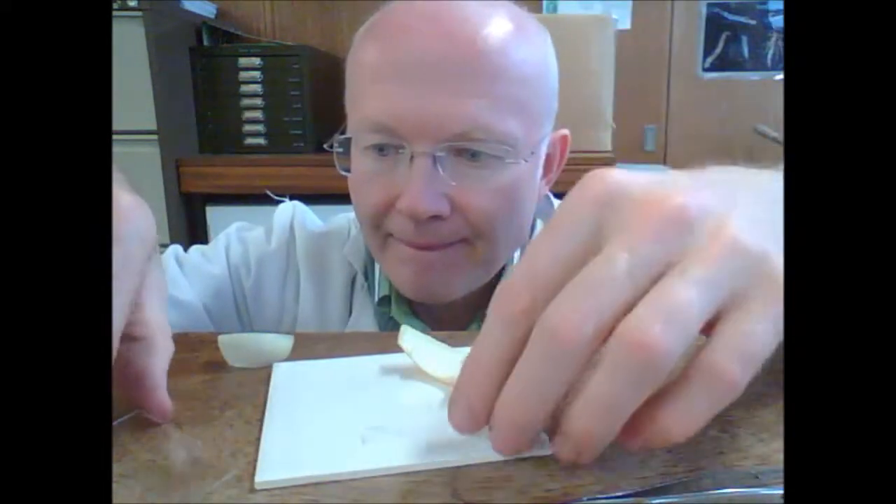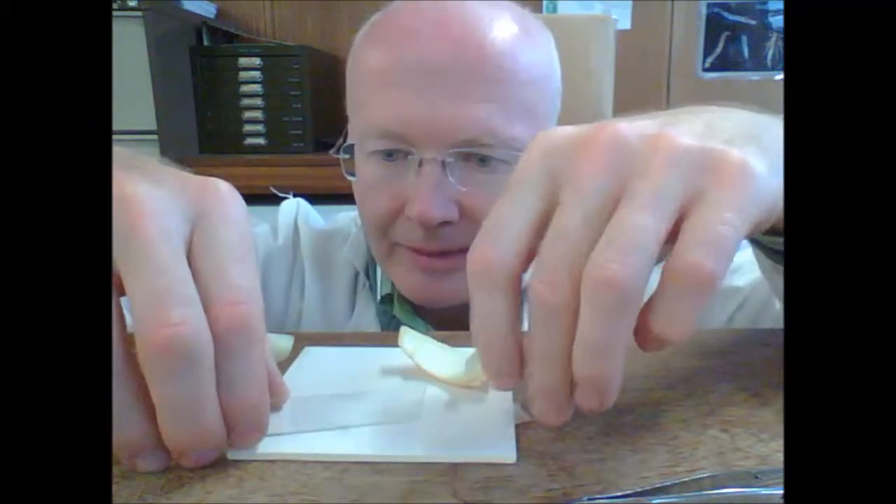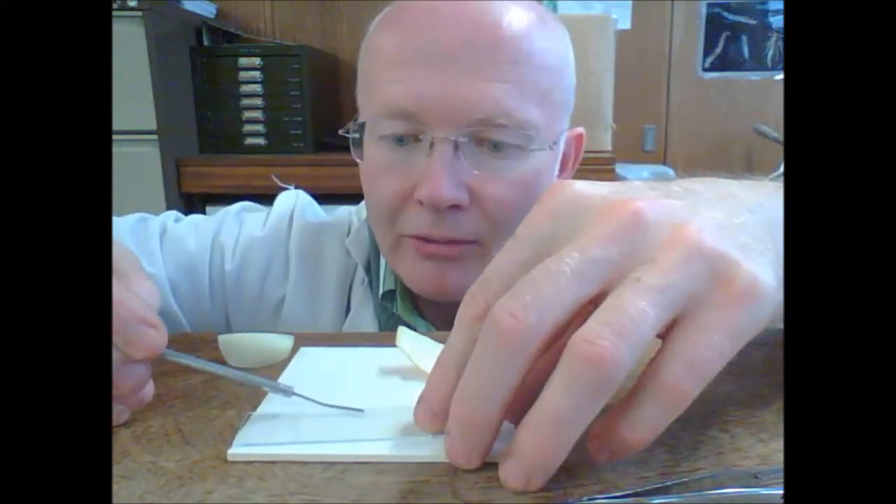I'm going to pop that onto a microscope slide. Make sure it's unrolled.